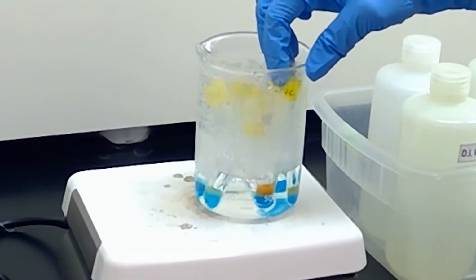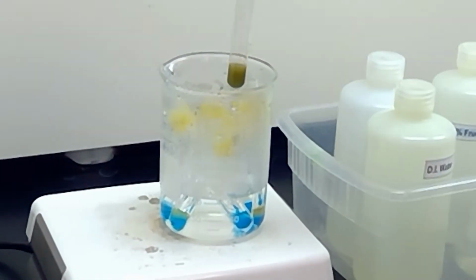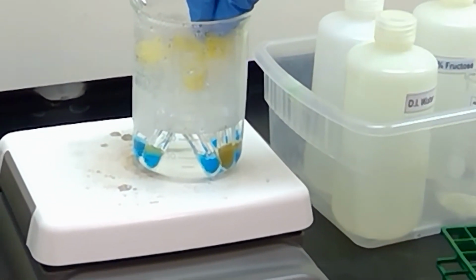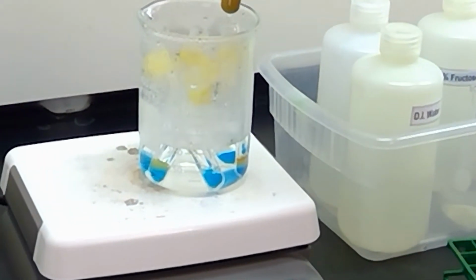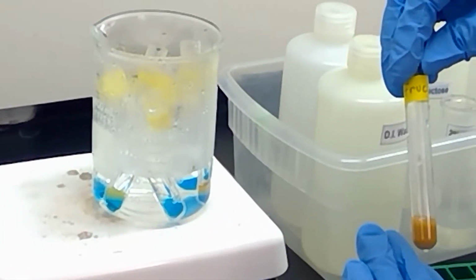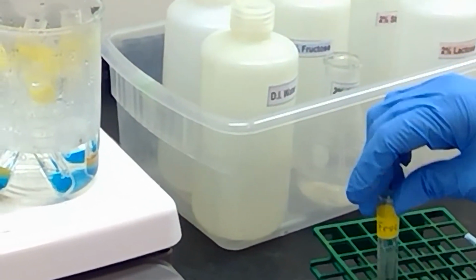Okay, this first one that is turning very, very red here, this is fructose. Okay, so this fructose here is going very, very red. And let me dip it back in there so I can finish changing. But this makes sense. Fructose is a monomer, and although fructose is a ketose, it can isomerize to aldehyde form and reduce the copper. Okay, so there's fructose so far.